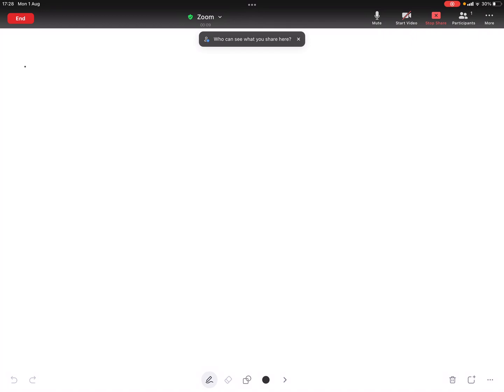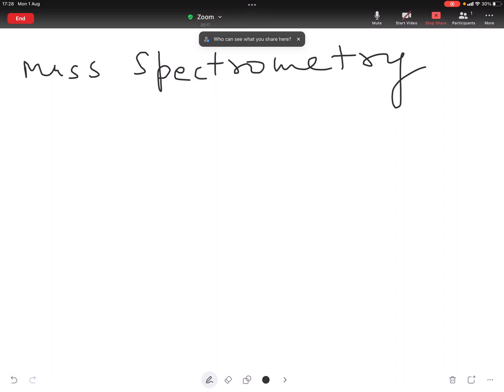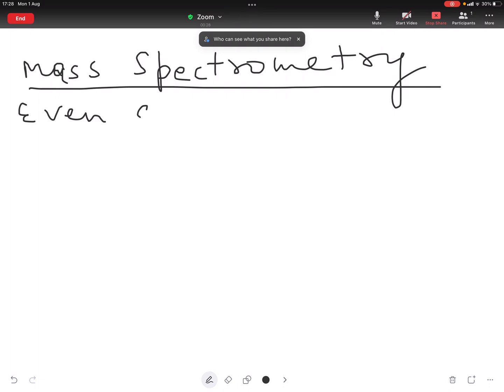We are discussing mass spectrometry. What is the even electron rule?